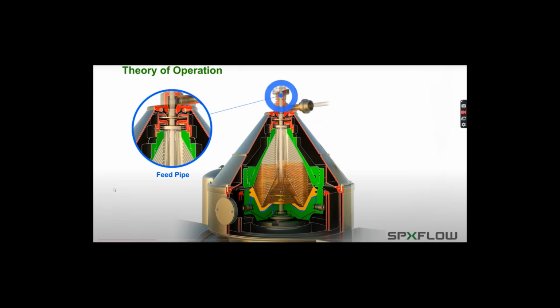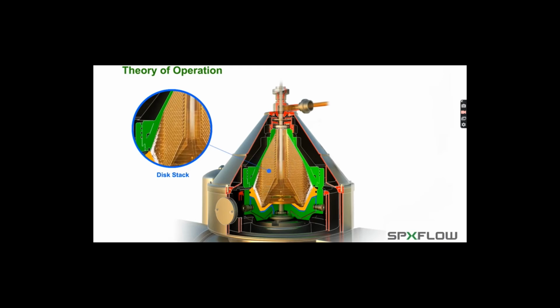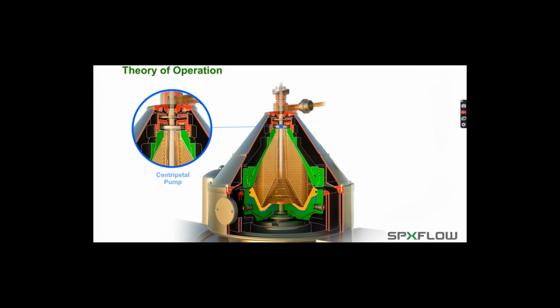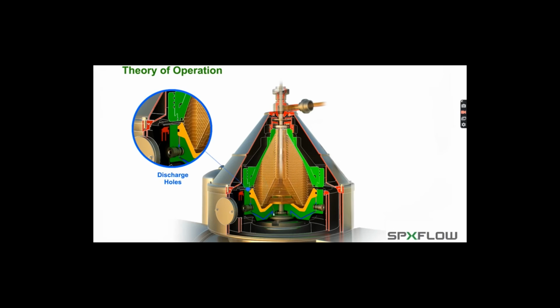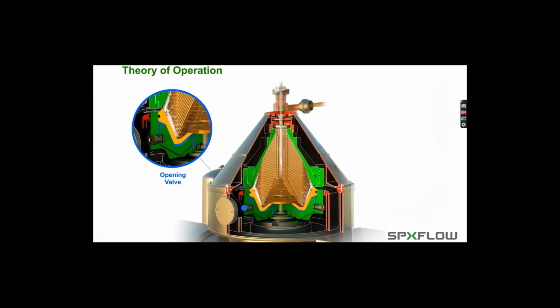As you remember, in bioreactors there were some kinds of control, and one of them was the oxidation of the liquid. There are a lot of reasons that oxygen should not get inside the liquid or suspension, because it causes problems later for the patient. So the process of oxidation in the bioreactors is very important, and as well at the centrifugal level, in separation or filtration, oxygen should not get into this content in any way. But it's not an easy job, because we cannot always seal everything, and this is a rotating solid object. Sealing it so that there is no way for oxygen to get through the passages and into the content is not easy.